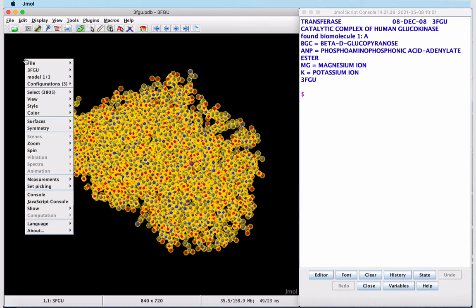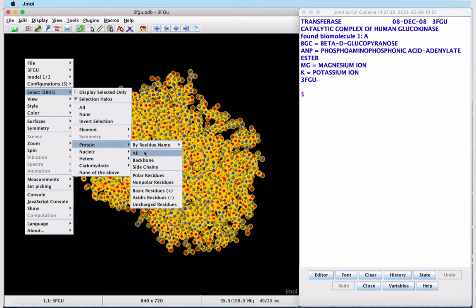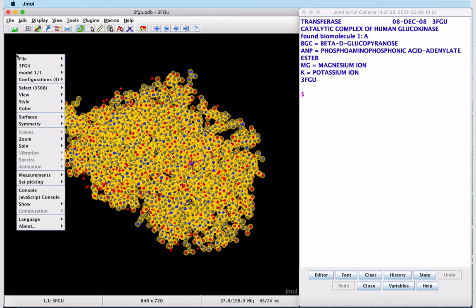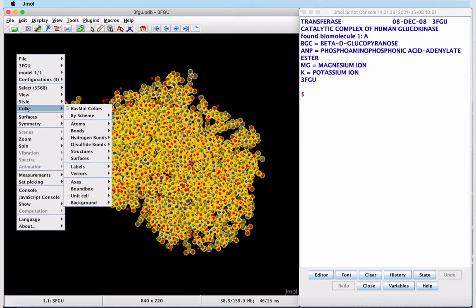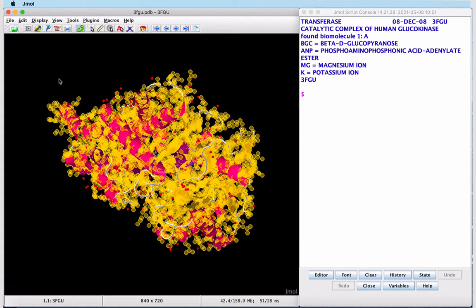Now we'll select the protein and show it as a cartoon representation. Style, Scheme, Cartoon. We can also use the drop-down Display menu to change our display.